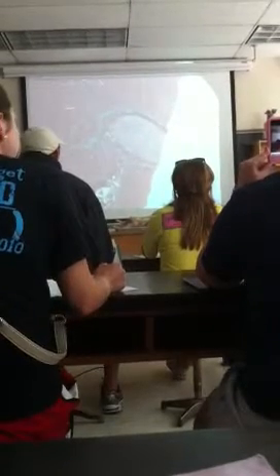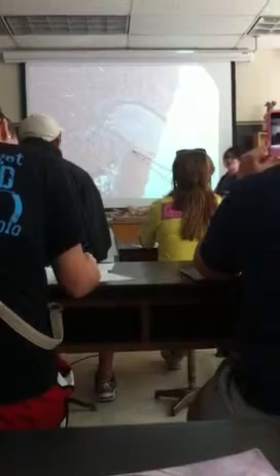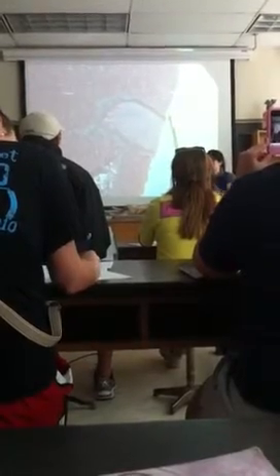But you can see this huge vessel running through right here. Compared to its overall size, it's got a pretty thin muscle wall. And you can see right here, it's filled with red blood cells. That would be a central vein. It doesn't have that really nice light colored layer around it. It's got a little bit of a clear layer, but not as defined, not as light colored as around the triad.